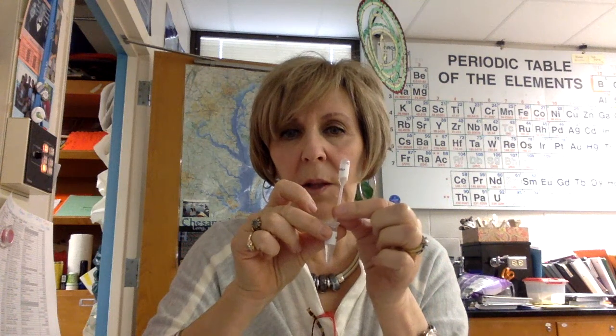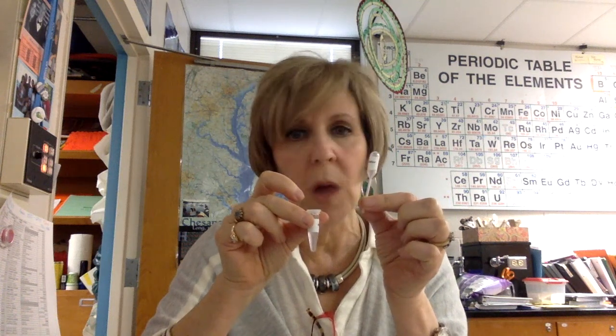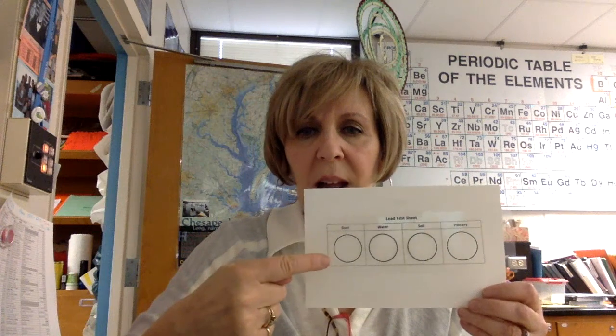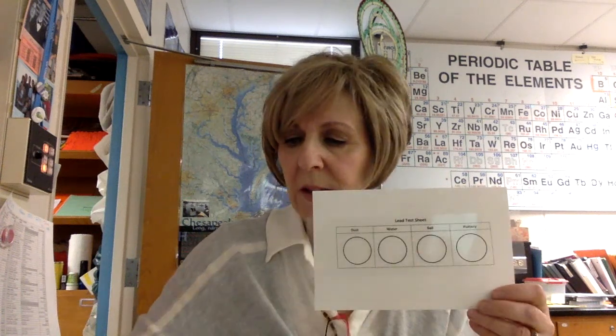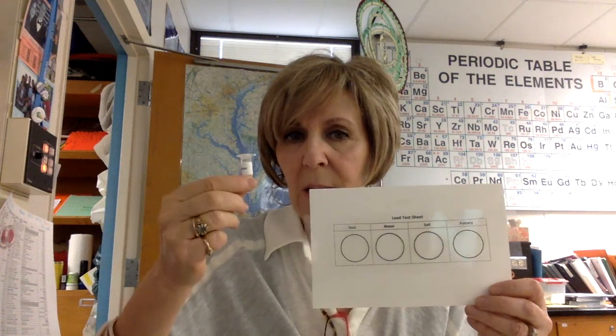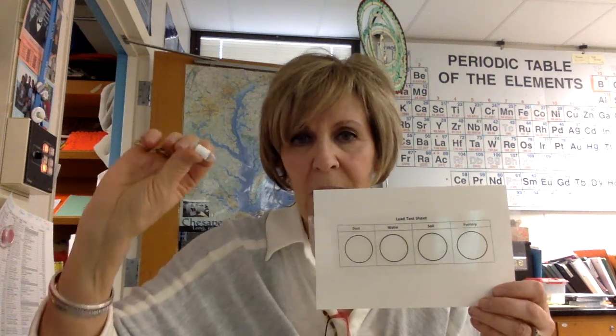So for example, this says water. So you're going to use the water pipette to take a little bit of a sample, just a couple of drops out of here. And then there is a little place where you're going to test the pottery, the soil, the water, and the dust. And so you're going to add a couple of drops, just 1 or 2 drops on each of these, using the sample with the correct pipette, so you're not going to contaminate.